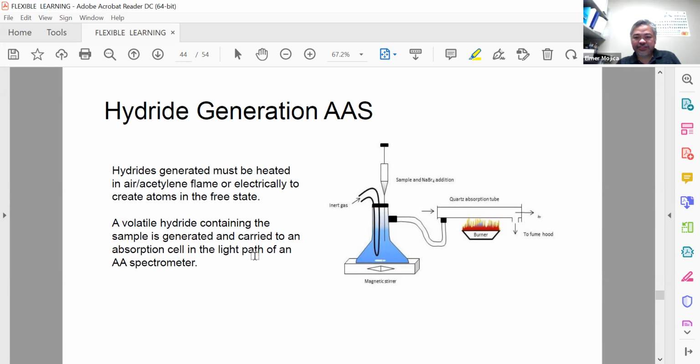Okay, so you have a sample in the sodium borohydride there. So there's an inert gas. So once your metal is produced, from an ionic form to the metal, it just passes through there. So it's just a safety precaution, the way that they do it.